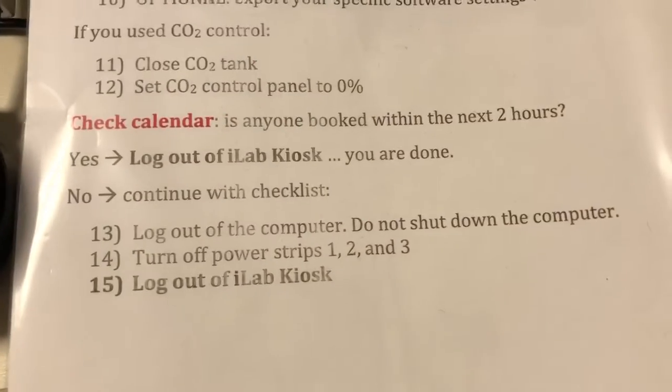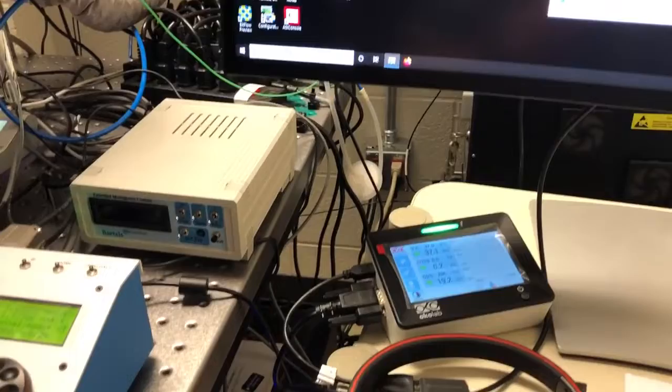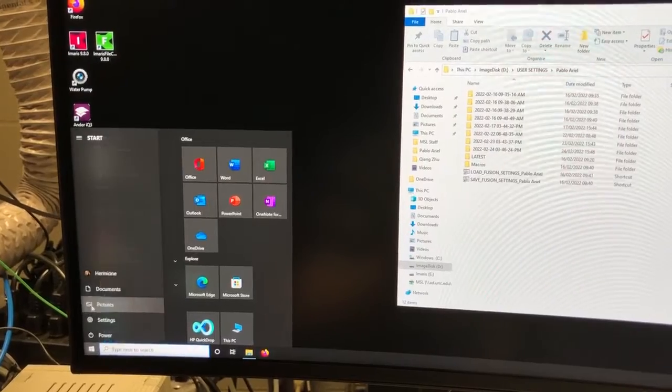If anyone is booked within the next two hours you are done — you can log out of the ilab kiosk. If not, you should continue with the checklist and log out of the computer. There's no need to shut down; the startup instructions go over how to turn the computer on, but the idea is that everyone will just log off and not actually shut down the computer.